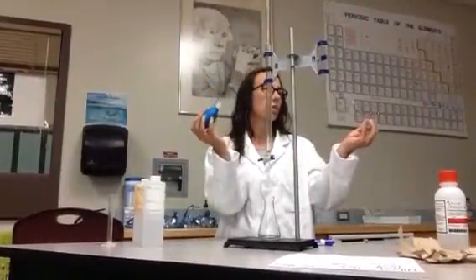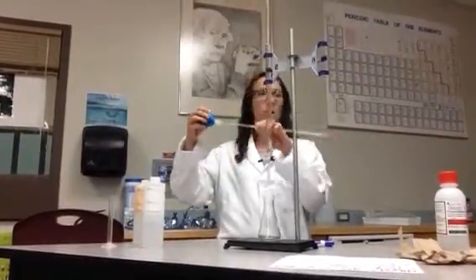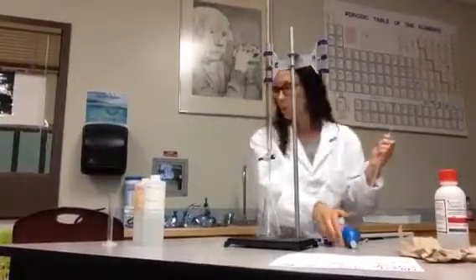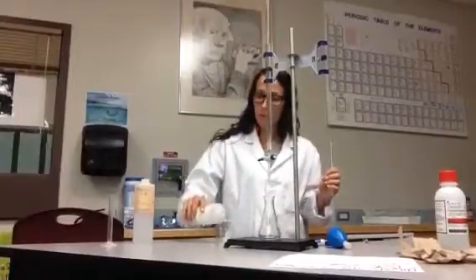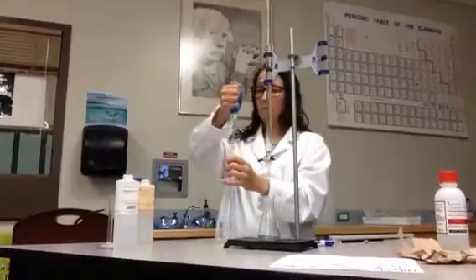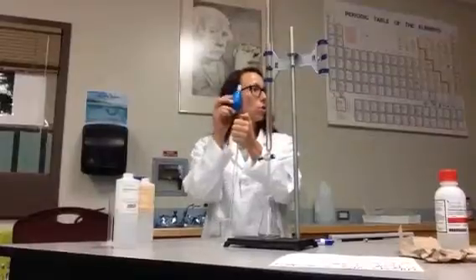So it acts like a turkey baster. You guys have seen turkey basters in your kitchen? This is going to suck up, I'm going to get it to go to the meniscus, and I'm going to let it go, and it's going to drain into my flask. But once again, I don't know what was in here before, so I'm going to rinse it just to be on the safe side. How many times do I rinse? 3. You bet. So suck it up. Be careful not to get it in the bulb, because if you get acid in the bulb, whatever else is in there will corrode. It gets kind of gooky.